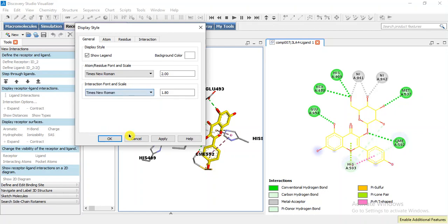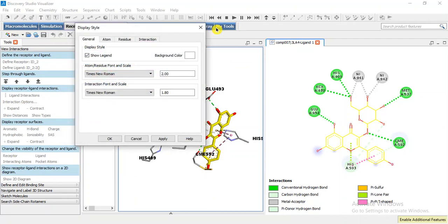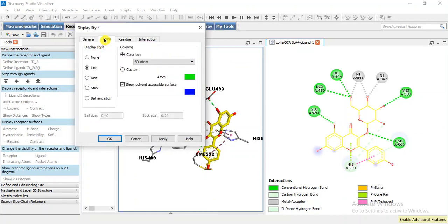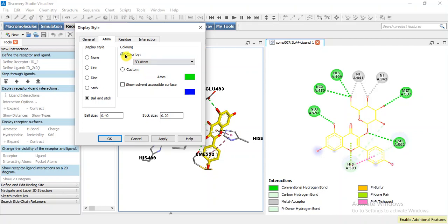For background color you may select any background color. Now it represents that we want to display the style of our ligand. Let's suppose I am going to make it ball and stick model and this is the size. We can adjust our size and this is the solvent accessible surfaces. I am going to remove it. We can also make this ligand with different custom colors, but if it is set to 3D atom it will take the color from the 3D docking pose.